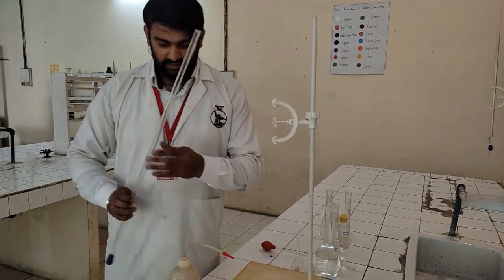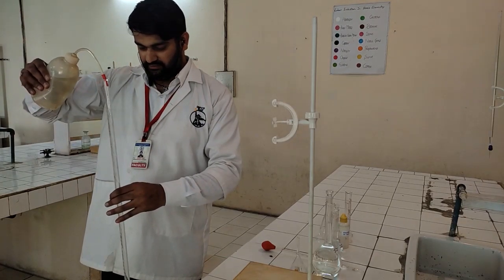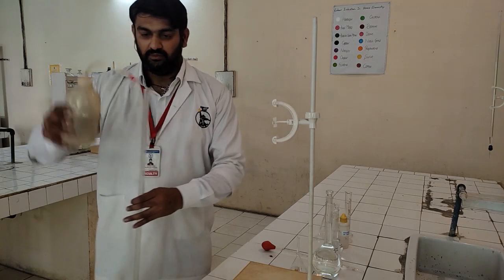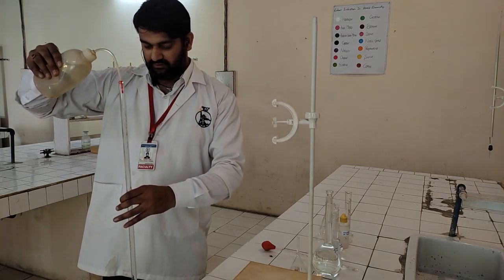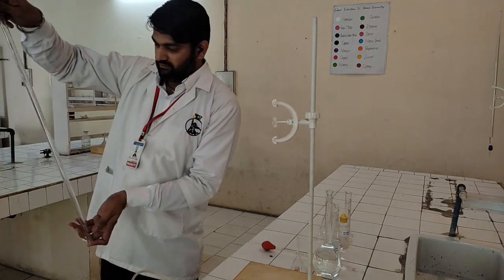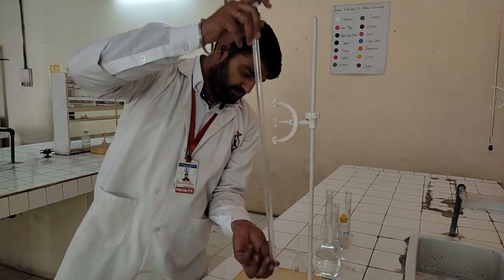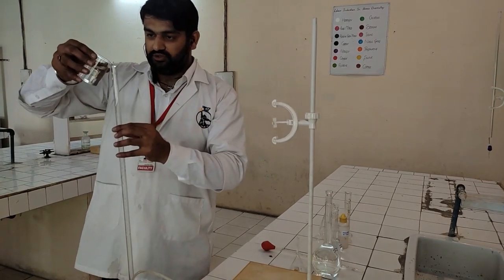First of all, clean the burette with distilled water. Then rinse it with standard solution.